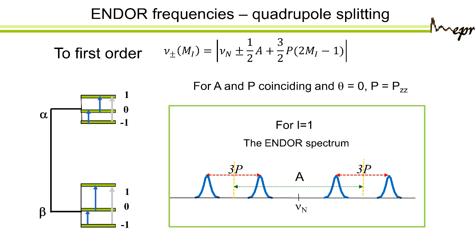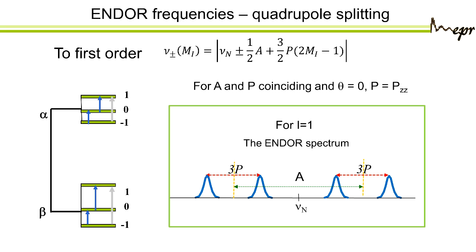Okay, so each spectrum of the deuterium that we had before had this quadrupolar splitting. Now this quadrupole also gives you a powder pattern, so it's a bit complicated. This is what you expect to see for nitrogen or deuterium. For nitrogen, the quadrupole is much bigger than for deuterium. And this is for axial symmetry.